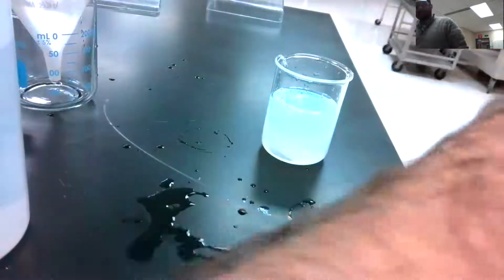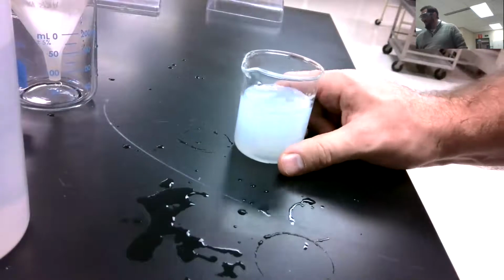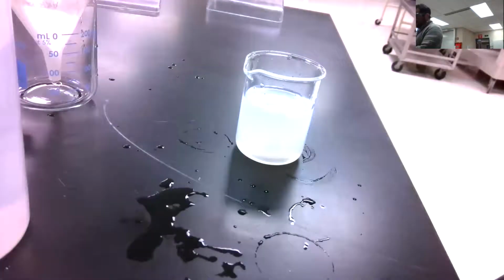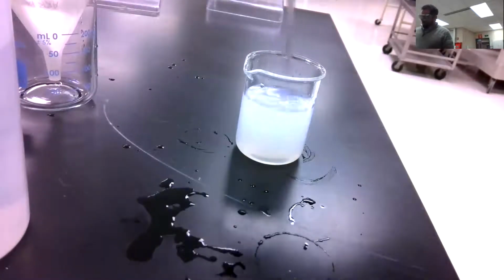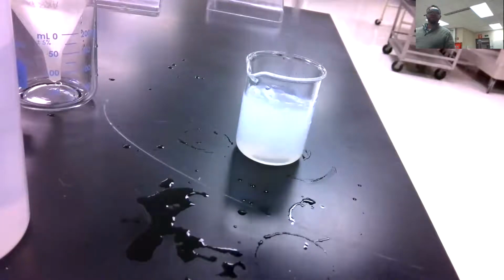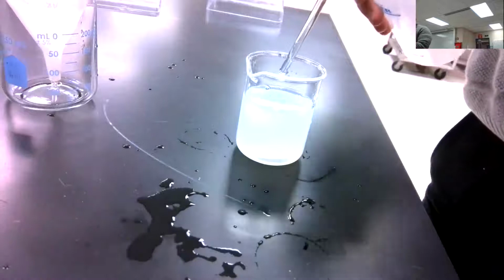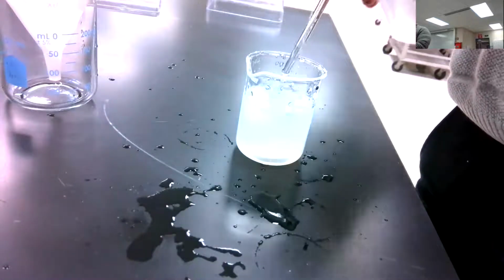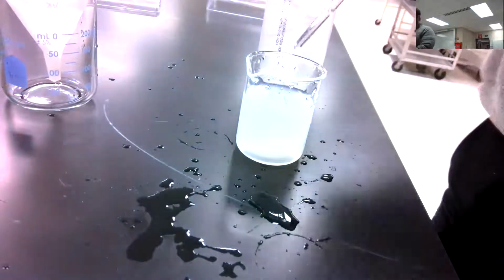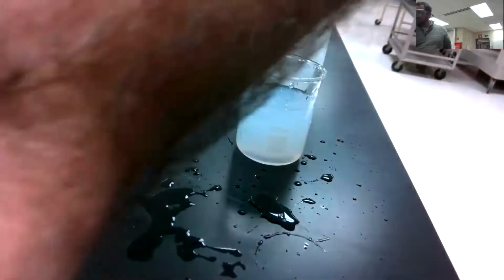Cool. Any indication of a chemical change? What do you guys think? I'd say definitely. You can stir it around a little bit if you like. Definitely indications of a chemical change. A chemical reaction has definitely occurred. Again, I don't want to just take my stir rod out of here, though. Make sure I keep all of my solution. So now I got some particle in there. Put that all in there.